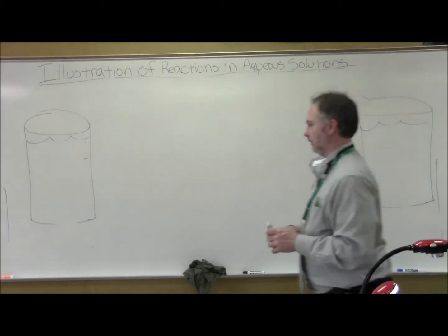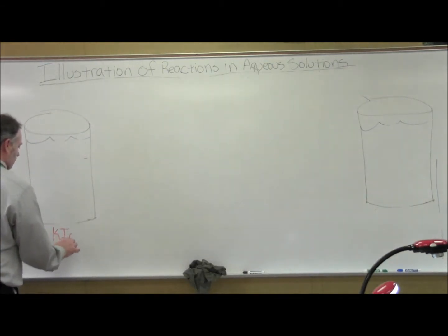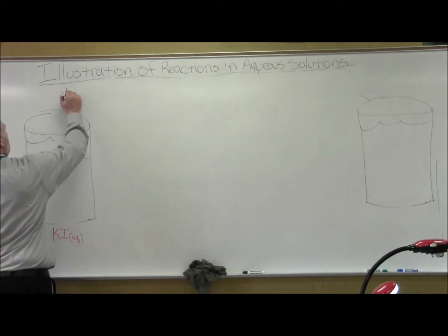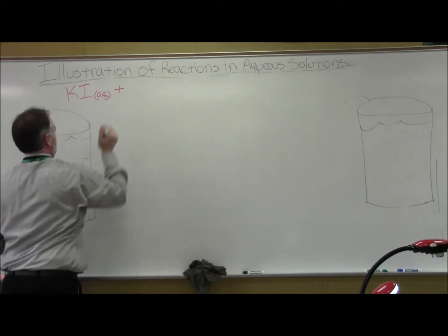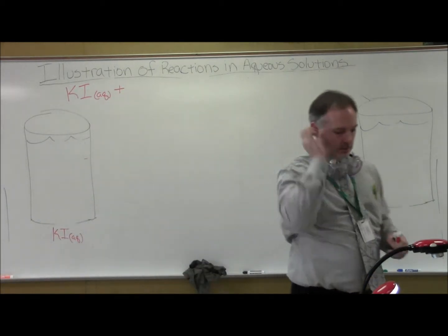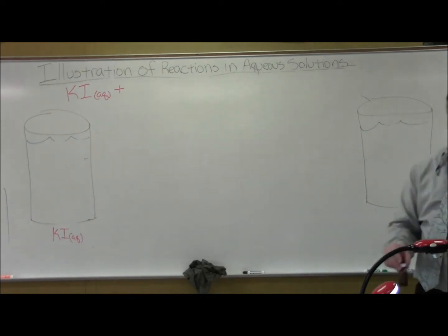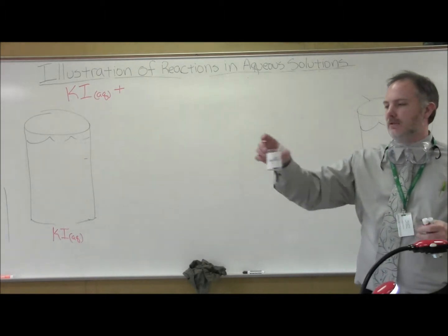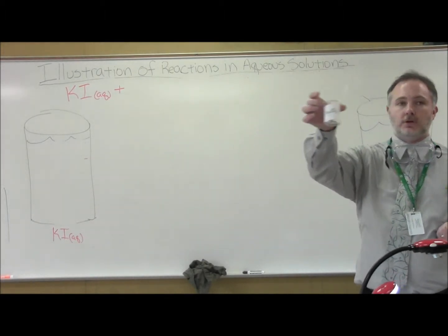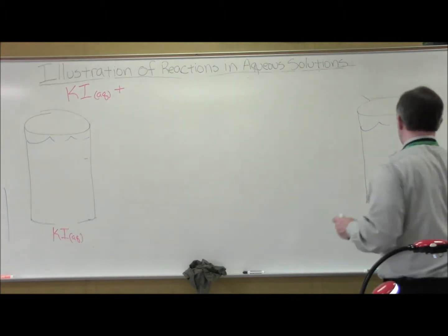That'll be one of my reactants. But this time, I'm going to mix it with something different, silver nitrate. And both of them are aqueous, they'll both be dissolved.